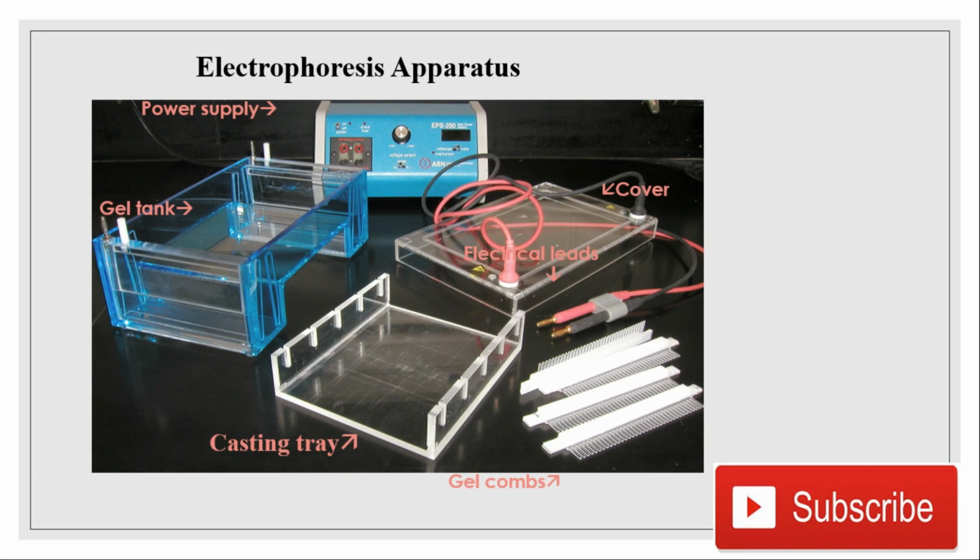तो मैं डिटेल डिस्कस करूँगा कि कौन कौन से इंस्ट्रूमेंट यूज होंगे। ये बेसिकली इलेक्ट्रिक वोल्टेज है, इसे हम जेल टैंक कहते हैं, और ये पावर सप्लाई है। ये इलेक्ट्रिकल लीड्स हैं और ये कवर है, ये कास्टिंग ट्रे है, ये जेल कॉम्ब है। While using the electrophoresis apparatus, it consists of the power supply, gel tank, casting tray, gel comb, and electric leads, and a cover that covers the gel tank while operating.